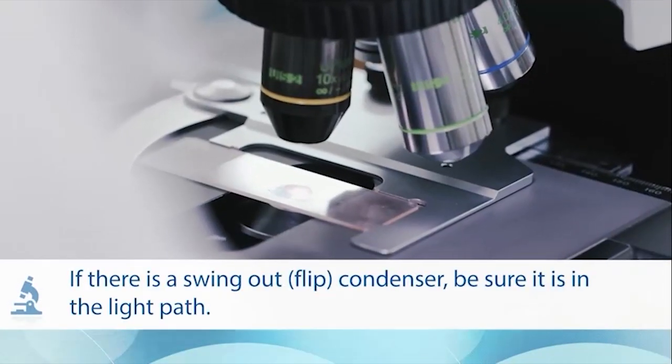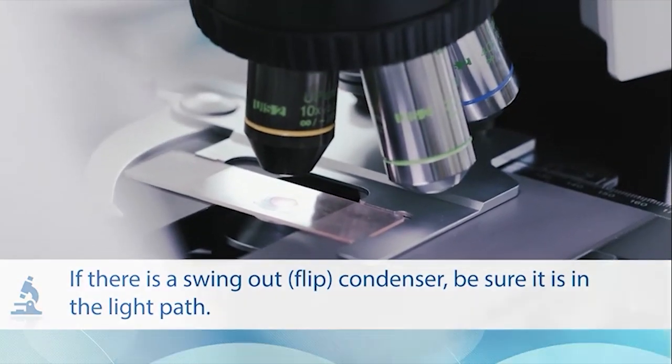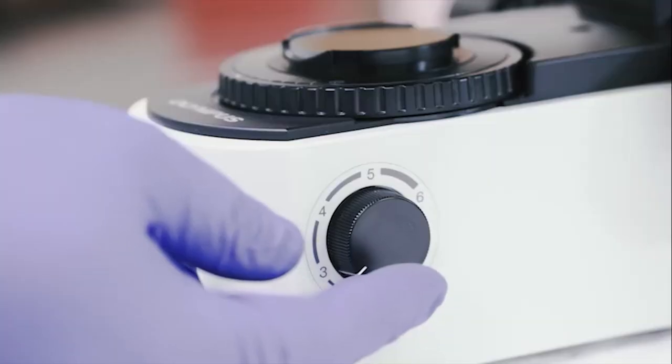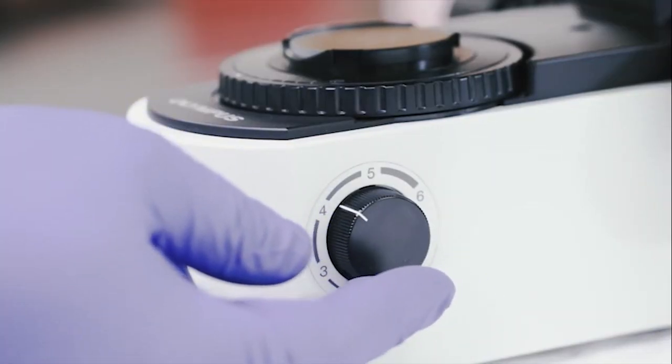If there is a swing out or flip condenser, be sure it's in the light path. Adjust the intensity of the illumination to a comfortable level using the light source knob.